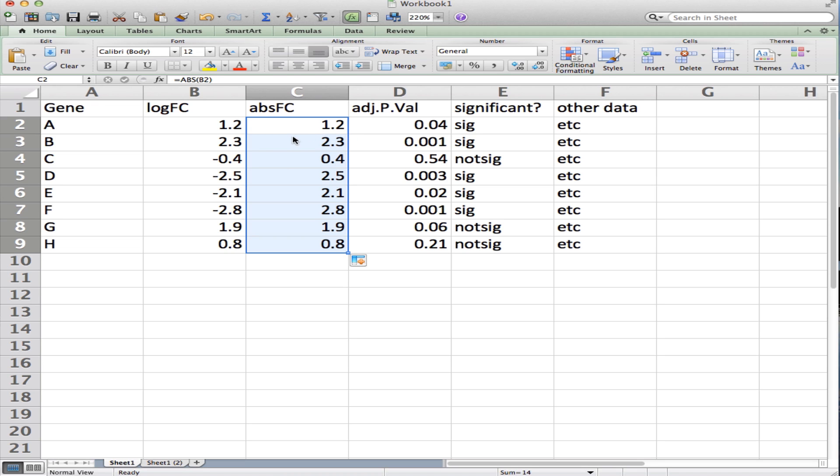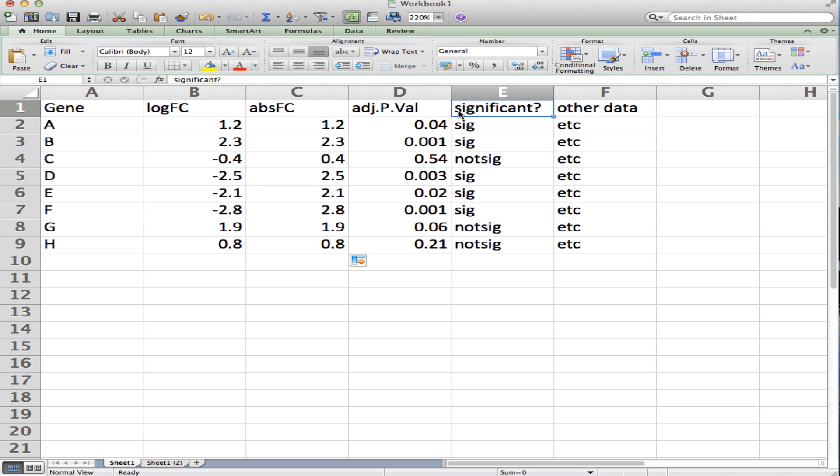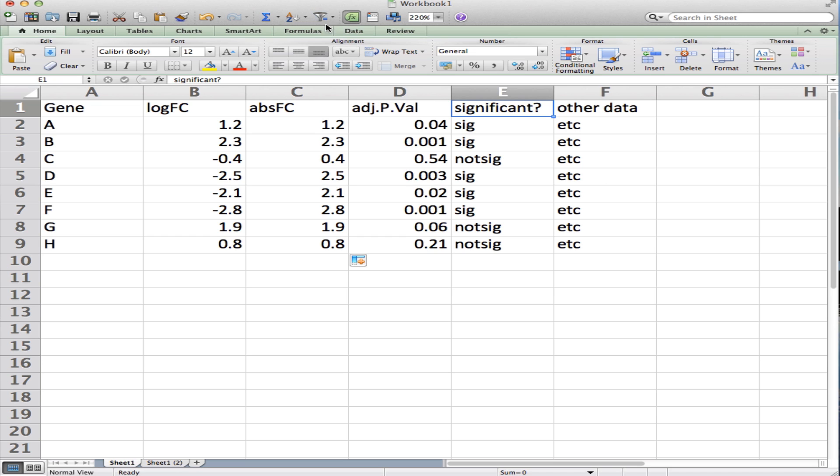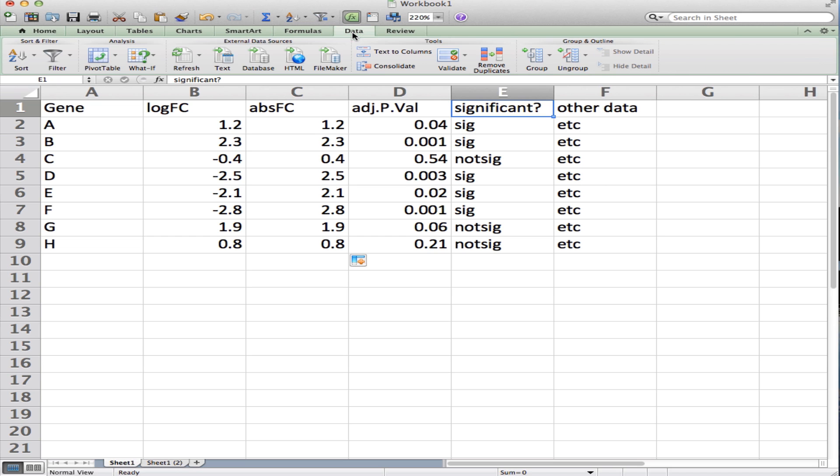This will give me the absolute value of the log fold change. Now, depending on which version of Excel you're using, I'm not sure where your filter button will be, but if you hit this little button that looks like a filter or a funnel—you can also go to the Data tab and hit Filter—you'll see that these little arrows pop up on the column headers.